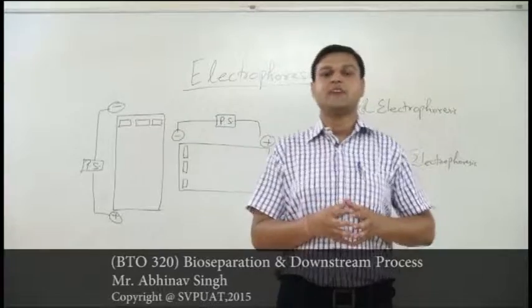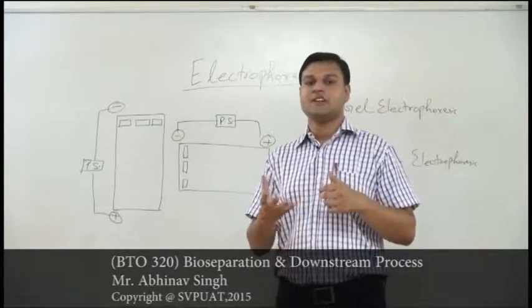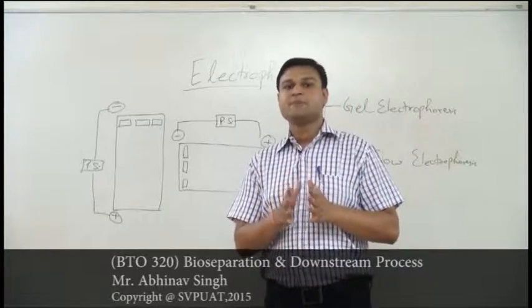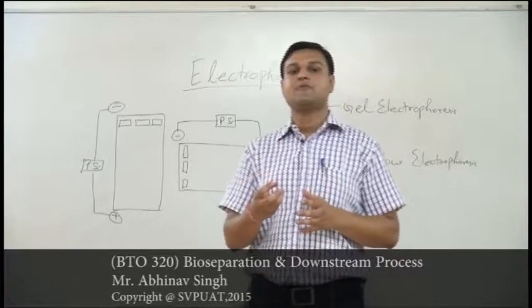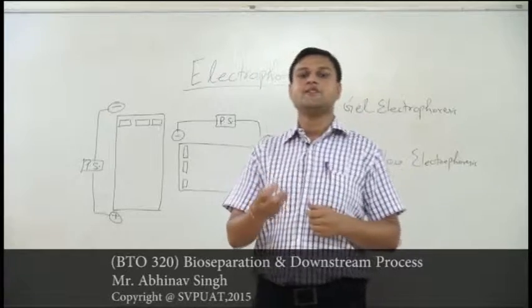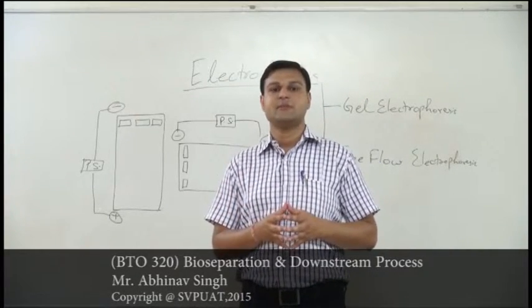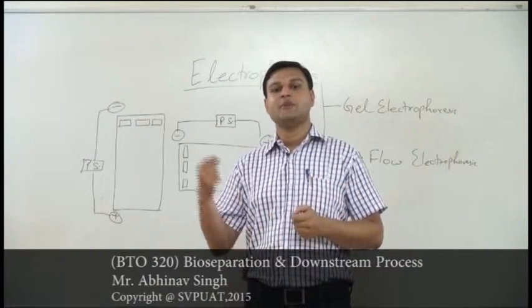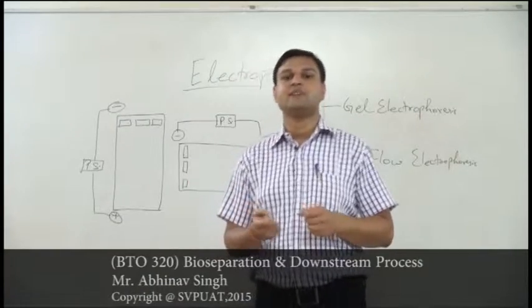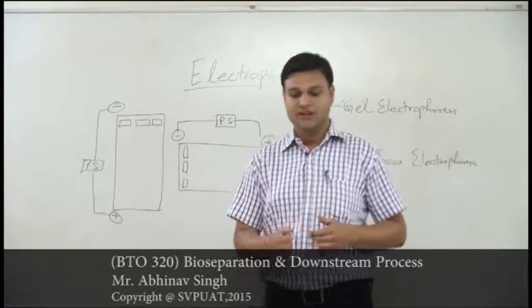How can this particular technique be beneficial? If our system has charged particles, they could be either positively or negatively charged. In the presence of the electric field, the electrostatic forces arising due to the charges will help such charged particles to move in this system. The negatively charged particle, as we know, will try to move towards the positive electrode, whereas the positively charged particle will try to move towards the negative electrode. This is the basic principle of this technique.